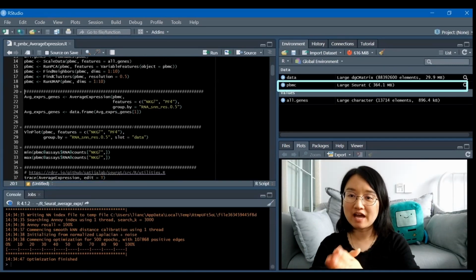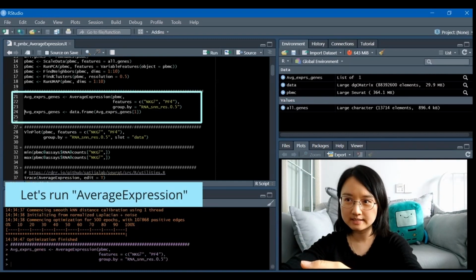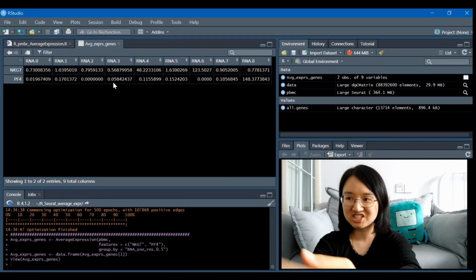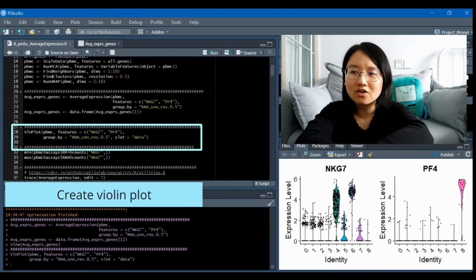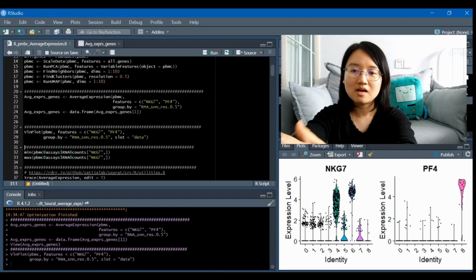Now we have the Seurat object, which is called PBMC. I divided the PBMC data into clusters based on resolution 0.5, and we got 9 clusters here. For this gene, which I just picked randomly, the value goes up to 123, and the rest may be just 0, so it's all positive data. I tried to plot the violin plot to see whether I got similar values, but obviously, in the normal violin plot, we can only get up to about 4 or 6 expression level.